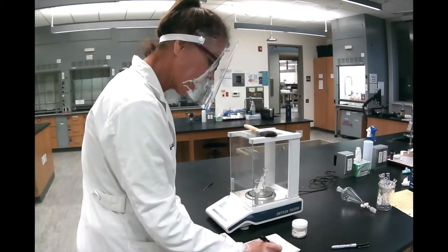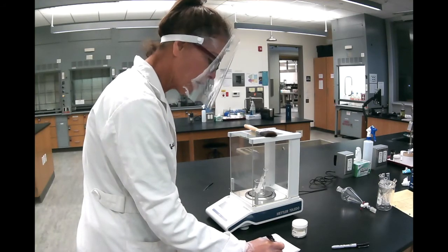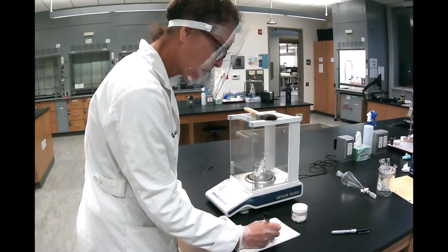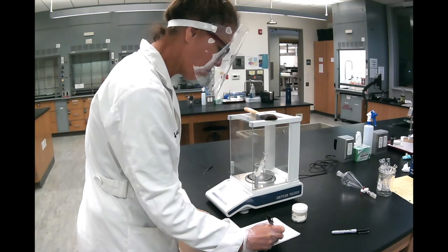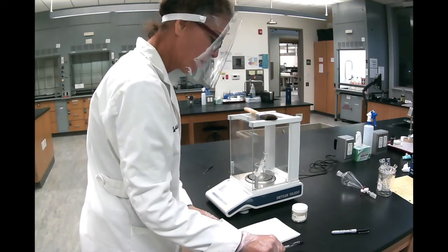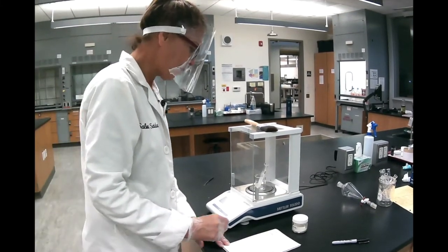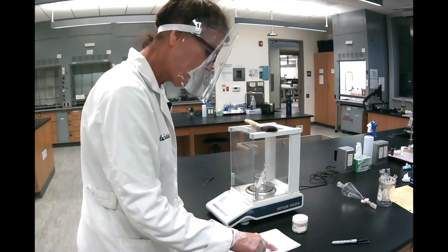So I did weigh earlier the empty test tube, and now I have my test tube and beaker plus the final product, and it's 44.6172. It looks I'm getting very close to pretty much what I started with earlier. Now, if it looks too high, I'm going to subtract here.